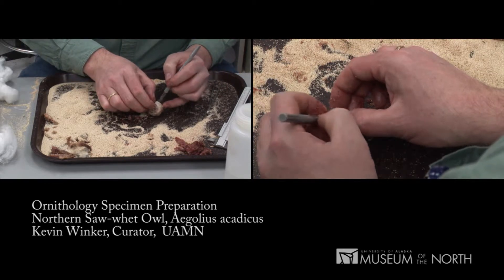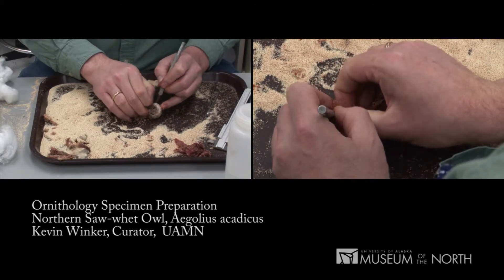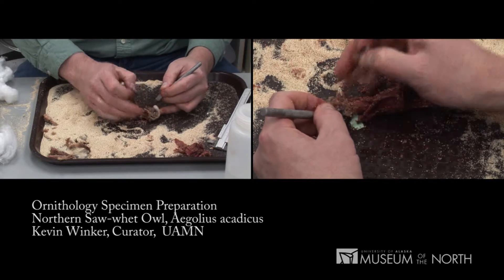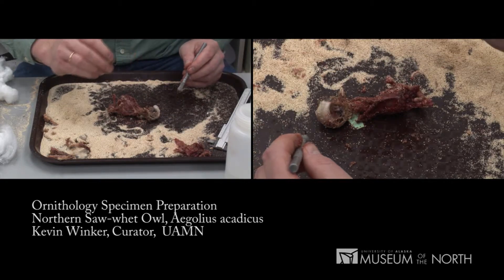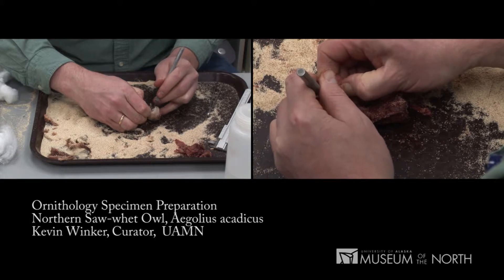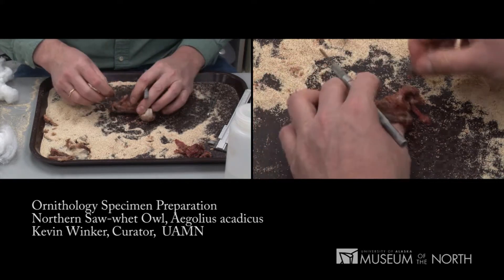Owl eyes — all bird eyes — have bones in them called sclerotic rings. Owl eyes are the most developed of these. Because there are bones in them, we keep the eyes with the skeleton, but we need to remove them from the skull. Owl eyes are large, bony objects. There's a lot of fluid in an eyeball. Once we get it out, we pop it, take the juice out. We put it into the body cavity where it will stay with the carcass as it dries and is cleaned up by the beetles. Those are two eyeballs done.